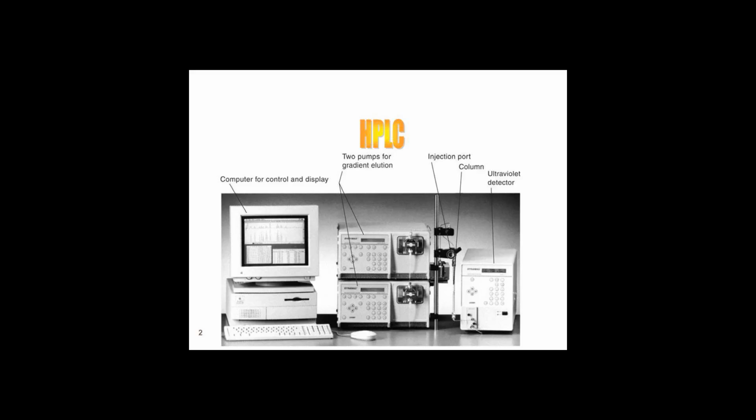Types of ion exchangers include polystyrene resins. These allow cross-linkage, which increases the stability of the chain. Higher cross-linkage reduces swelling, which increases the equilibration time and ultimately improves selectivity. Cellulose and dextran ion exchangers, gels: these possess larger pore sizes and low charge densities, making them suitable for protein separation. Controlled pore glass or porous silica.